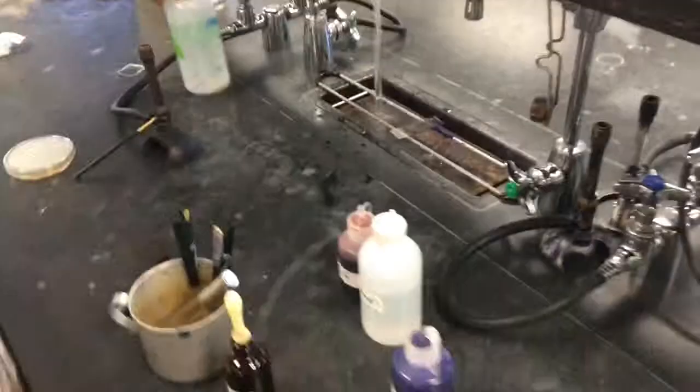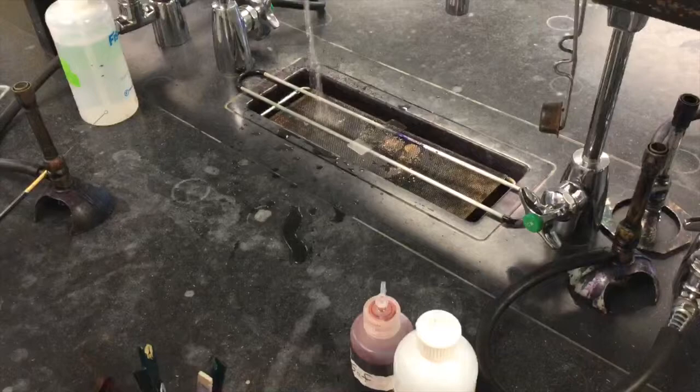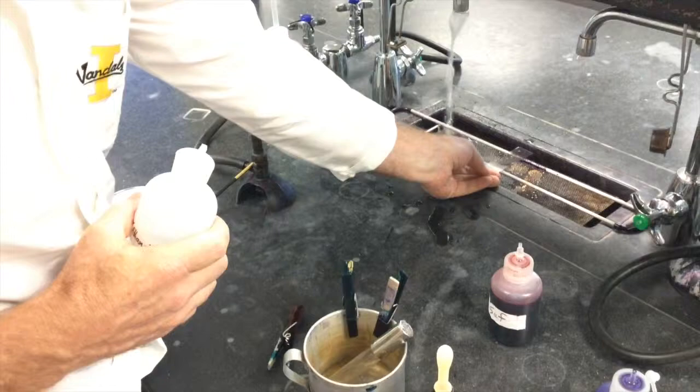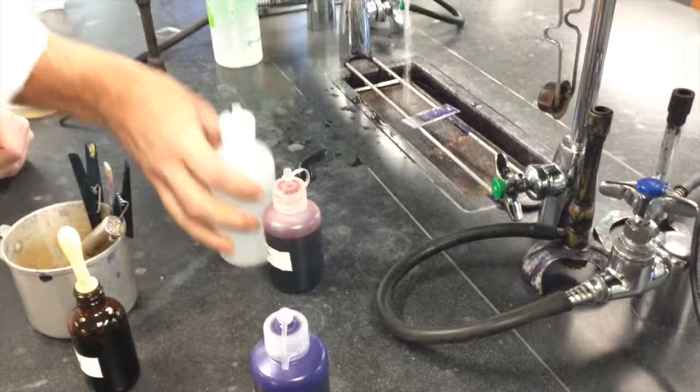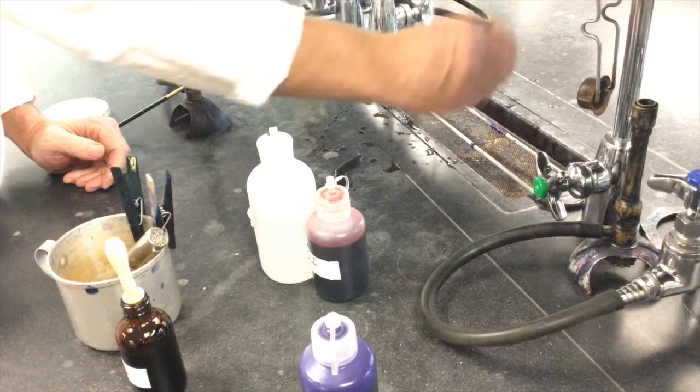So now my slide has been washed and it's ready for decolorization. And today we're just going to do the timed decolorization step. And so to do this, you want to make sure your slide is flat on your staining rack. And you want to flood your slide with the alcohol and count 10 to 15 seconds. So it's been 15 to 10 seconds. And you want to stop the decolorization by washing it gently with water. That's our decolorization.